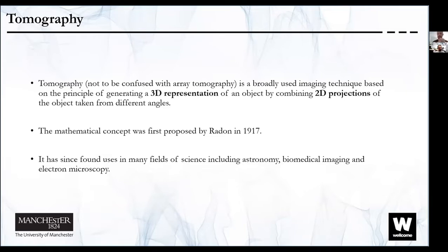Whereas with tomography, there is no sectioning or cutting. What you have is a 3D EM data set that is generated mathematically, or computed, from a set of 2D projections through a 3D object, which sounds very abstract, but it's actually not too difficult to understand. You don't have to understand the maths behind it. I don't, but it's easy to think of how it would work.